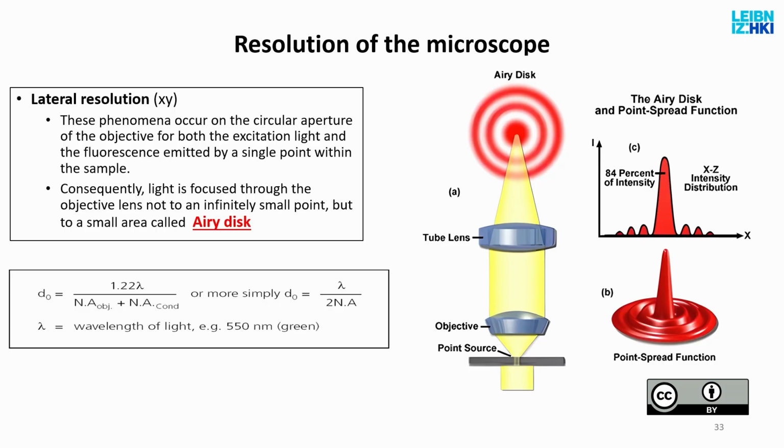Now, this means that a good lens, a higher NA lens, will have an Airy pattern which is relatively small. A worse lens, which will be the relatively low numerical aperture, will have an Airy pattern which is relatively large, because the resolution of that lens is worse.